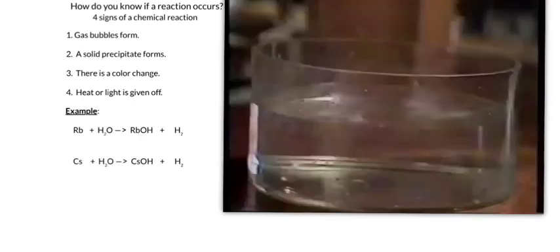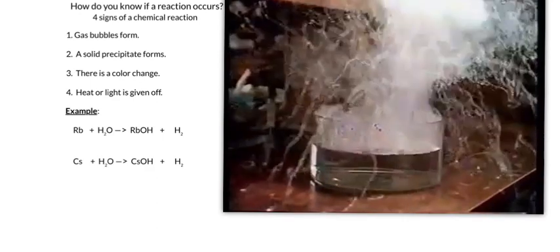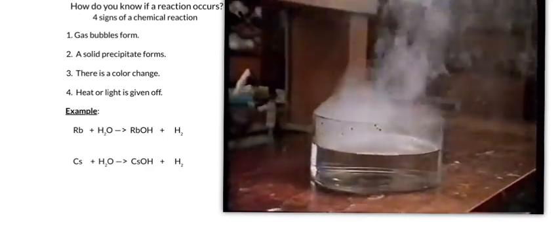Let's look at the following 2 examples. We'll look at rubidium reacting with water and cesium reacting with water. Let's watch the video. That was rubidium. Let's see that again.